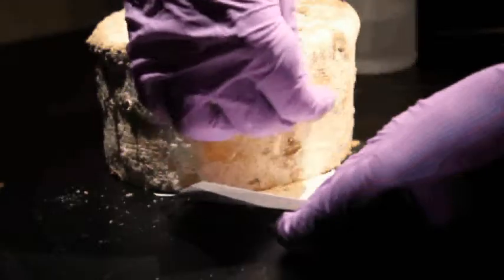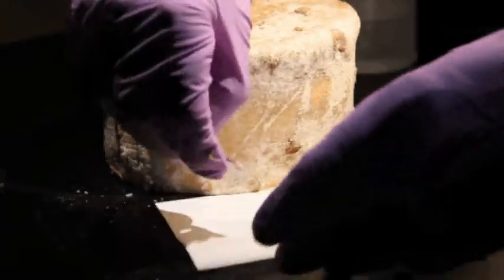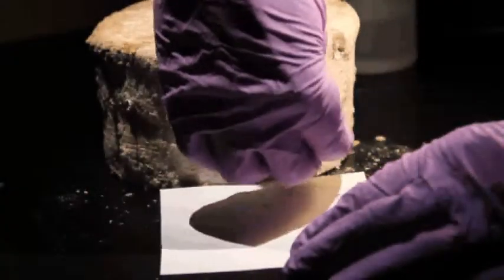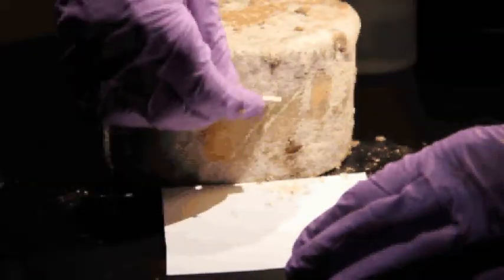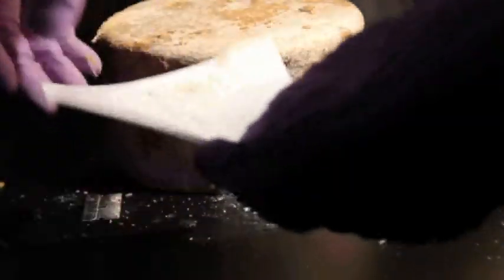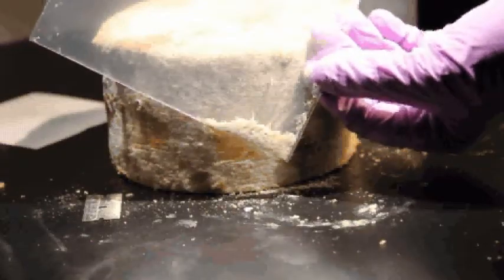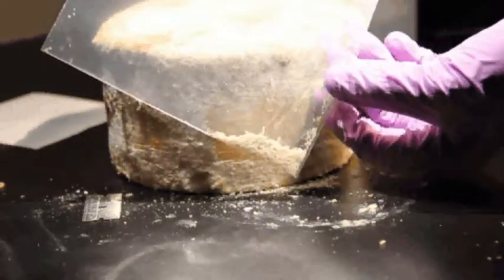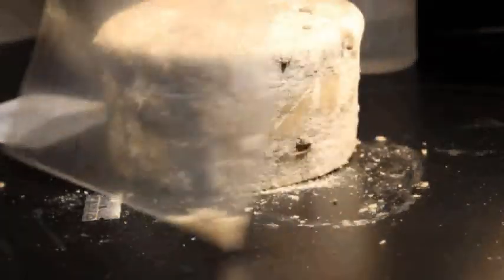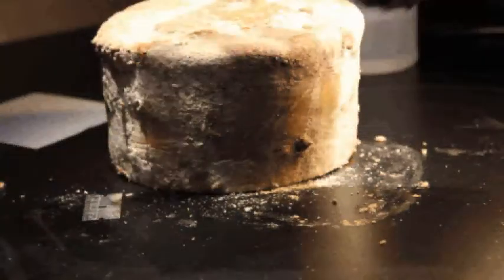Try to scrape from one particular area of the cheese you're sampling and not across the entire wheel, but use your discretion so the cheese doesn't get completely denuded. That should give us enough to work with. Ideally, you would repeat this process on two additional wheels. Each sample from each wheel should be in a different plastic bag, so we should receive three plastic bags per cheese. Thanks for your help!